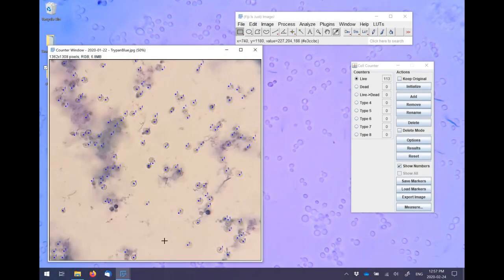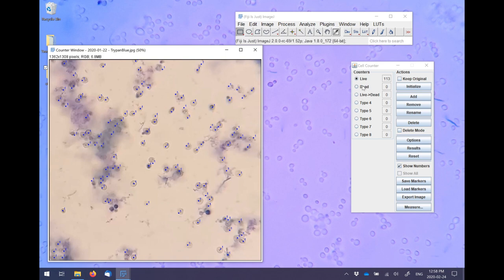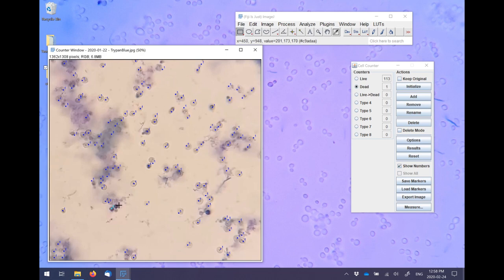Once you're done counting live cells, click on Type 2 and rename it to Dead. Begin clicking on the Dead cells. As you can see, a different color marker is used, making it easy to ensure that you have not made any errors and that you're not double counting cells.